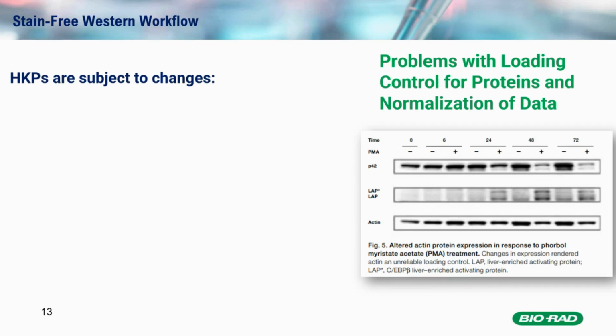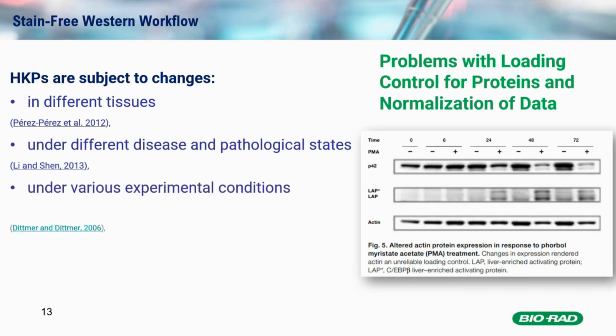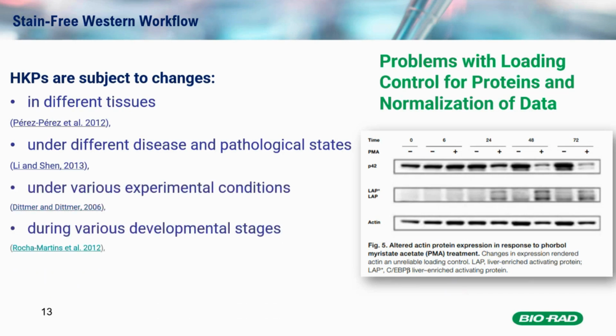On the other hand, housekeeping proteins are subject to change according to different tissues, under different disease or pathological states, under various experimental conditions, and during various developmental stages or different genetic backgrounds.